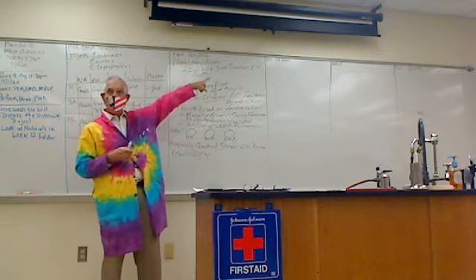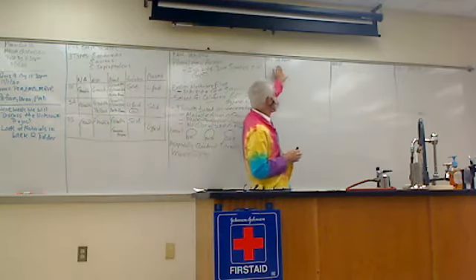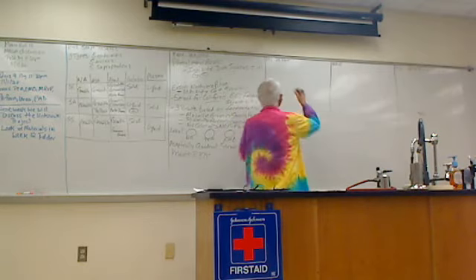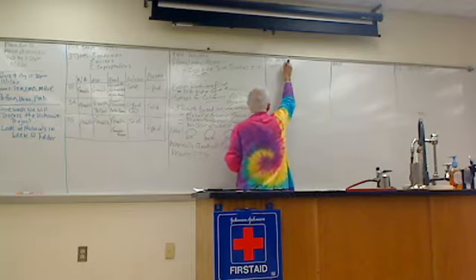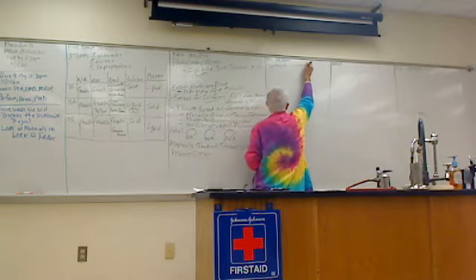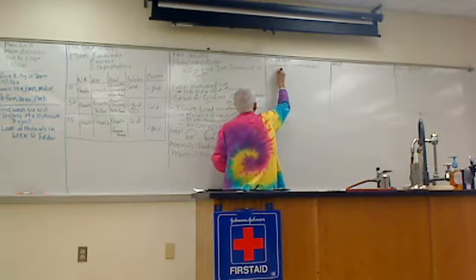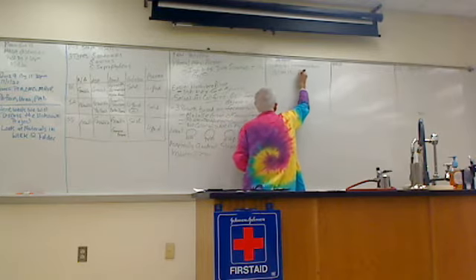So let's talk about the PR fermentation and what you're testing for. Well, in the name here, guys, we're testing for fermentation. Okay? So testing for fermentation, and yellow is positive.